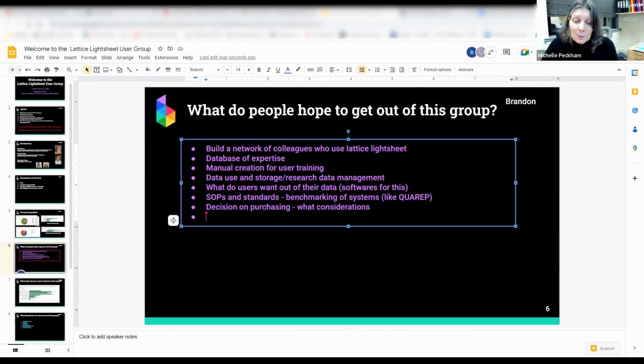But they were very useful because we did talk about what sort of specimens we were putting on the light sheet, how they worked, what sort of imaging, what the problems we found were, whether Zeiss had found the workarounds that we needed to get the sort of imaging that we needed. Because I think there still are only 3 lattice light sheets in the UK. I think that's right. Possibly that's gone up now. But that was really useful to compare for a specific machine what the challenges were and how to get the best out of them, especially when they're new.